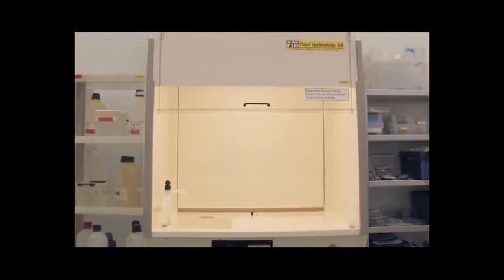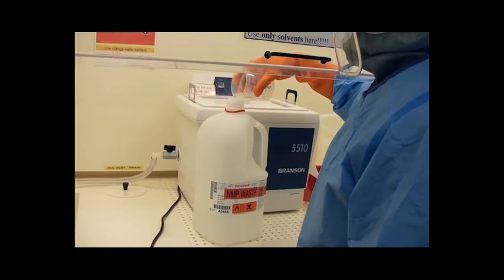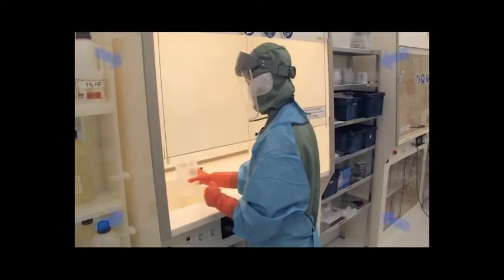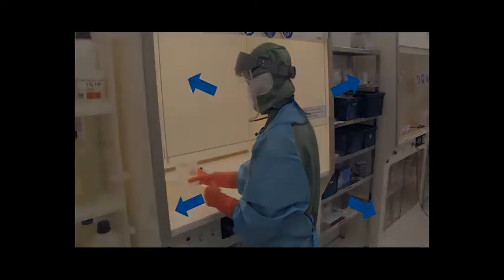The air exhaust system is very efficient and prevents chemical fumes from entering the laboratory. The particle level inside the fume hood depends on the particle level of the air surrounding the hood and the particles generated by the operator.